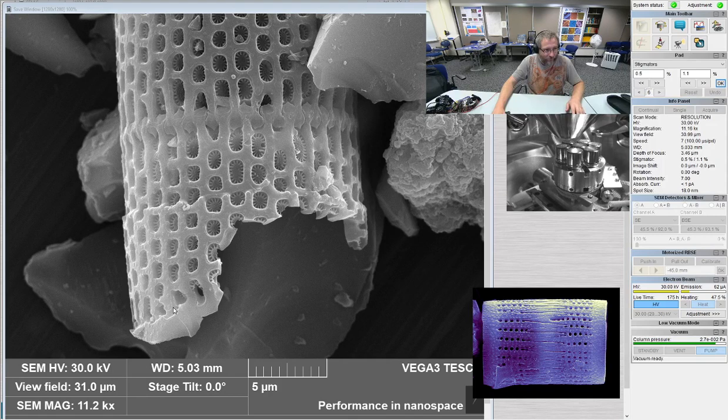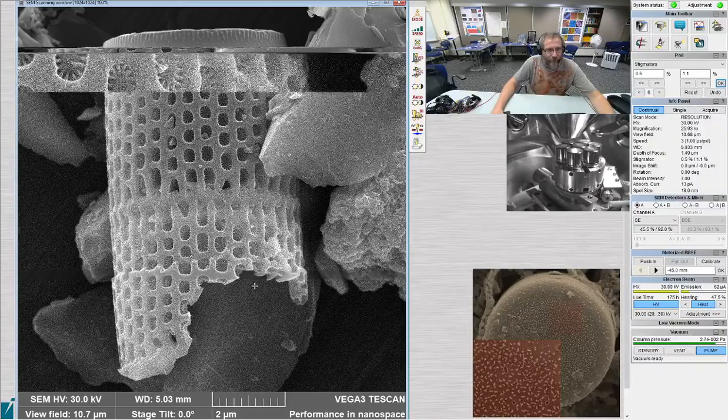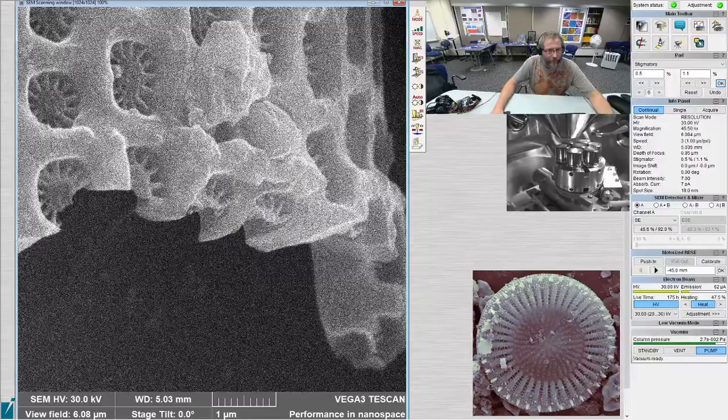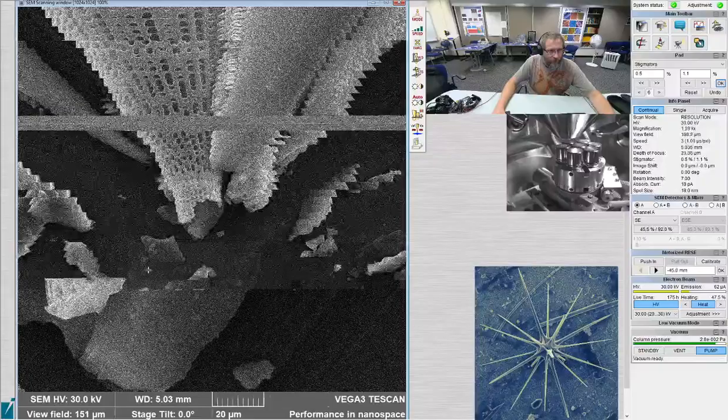I like the bottom of that, where you can see this weird ridge. I was going to say the sieve covering's on edge, so you can see the whole area. That ridge from the girdle band again. I think that they're halfway between. I think you can see that they're not quite loculate. They're halfway between, maybe a little bit closer to the outside, but they're depressed, and then there's a big indentation here. So, not bad. What's this one look like?